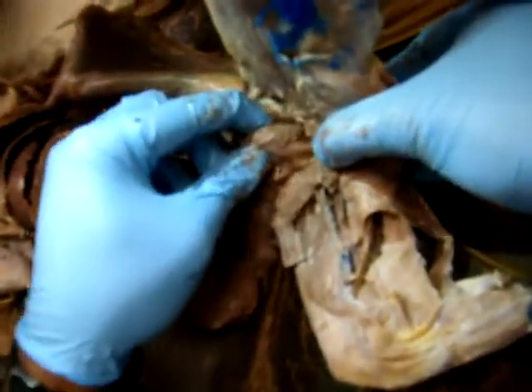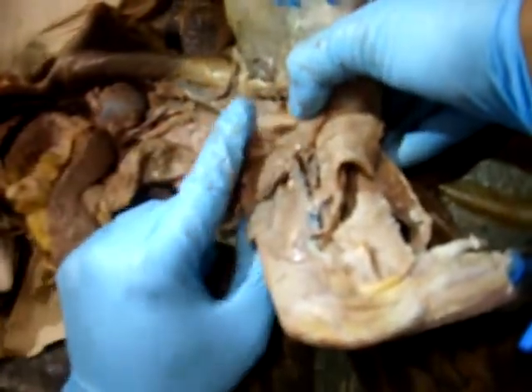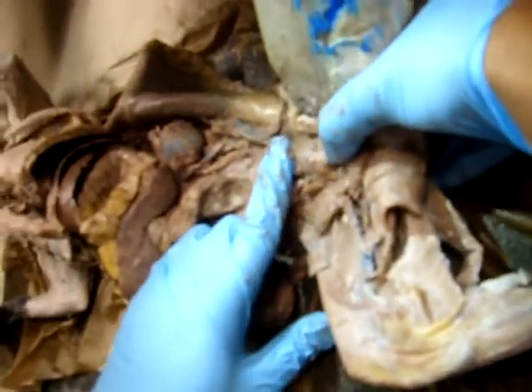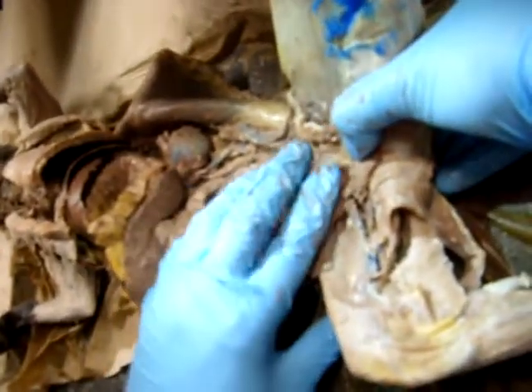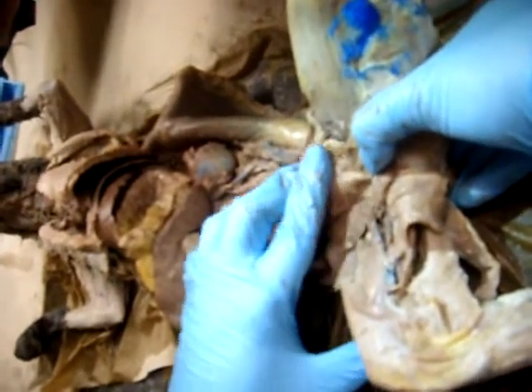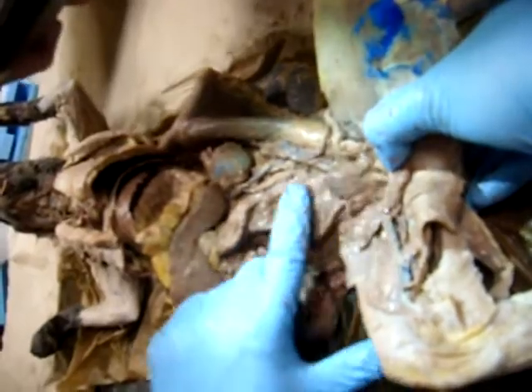The bladder leads to it. So I don't know if you can see right here. Yeah, the tube. The pee hole. So, not the pee-pee hole. That would be the orifice. But, like, see this part where it gets skinny is the neck? Well, it's leading to a tube, right? The tube that it's leading to? The urethra. That's the urethra. You got it? Okay, and then that's the bladder.